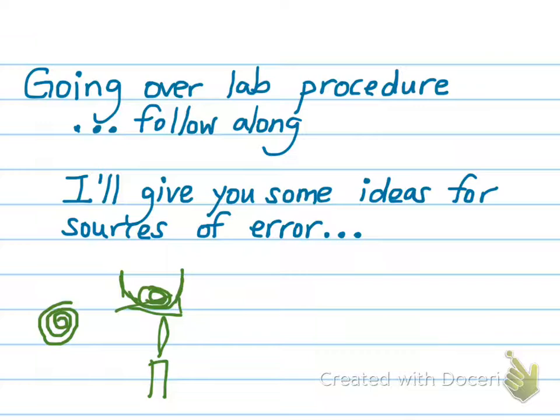So this is definitely an area where there are sometimes sources of error. First off, your crucible has like a lid on it. So why is it, do you think, that as you're heating this, you have to take the lid off of it every 2 to 3 minutes?